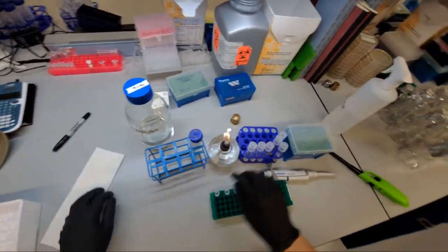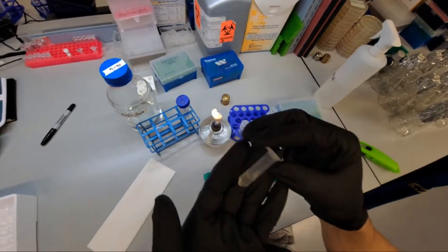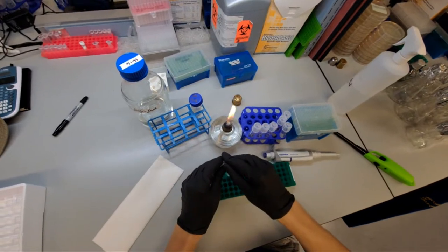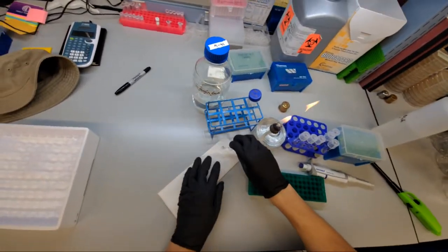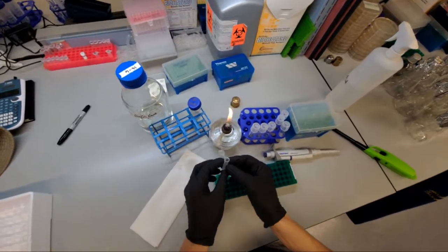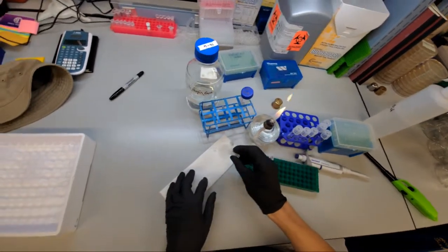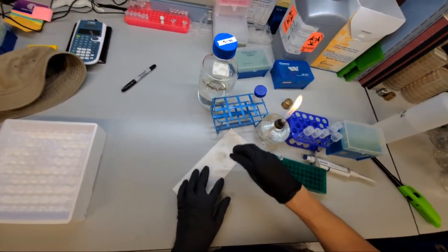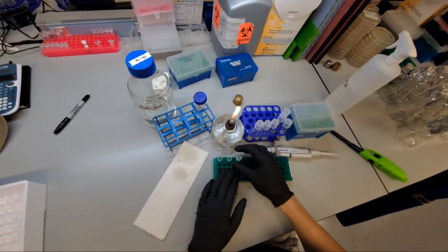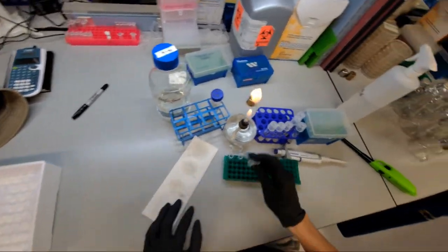I took the overnight cultures and I spun them down, just 500 microliters. You can see that it's a pellet now. So what I'm going to do is dump this out. Normally I would do this into a container but I just have three of these samples and I want to be really meticulous with these. So I want to do it at my bench. It's just one and a half mils of liquid.